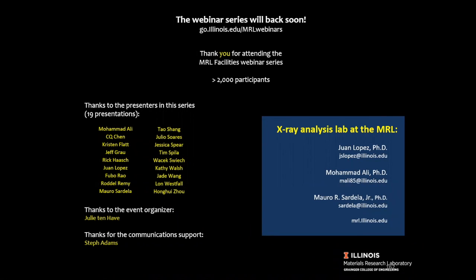Thanks. How do you subtract the holder background from scans in Jade or HighScore? Oh yeah, that's a very good question, and a complicated thing. First of all, you have to make the odds in your favor. First, you do a measurement: you measure a background holder signal with the exact same conditions as your sample.